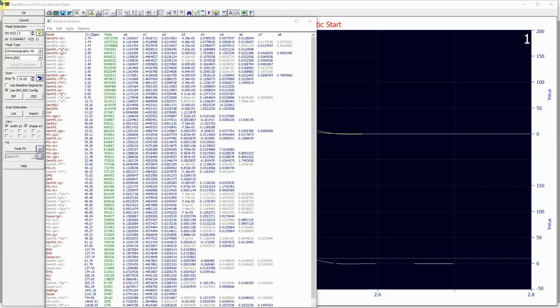This model discovery simultaneously determines which of the instrument response functions, or IRFs, best describes the instrumental distortions in the peak shape. In this case, the best model is a twice generalized chromatographic model with just a single first-order kinetic component. This is a useful observation since peaks which elute in a gradient often have only a small exponential IRF remaining. This is because the gradient in the opposite direction cancels much of the IRF, leaving only a small measure of the exponential component remaining.